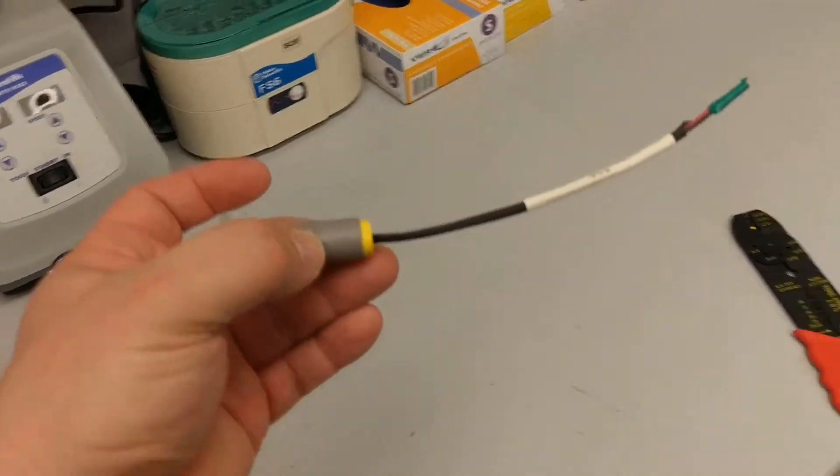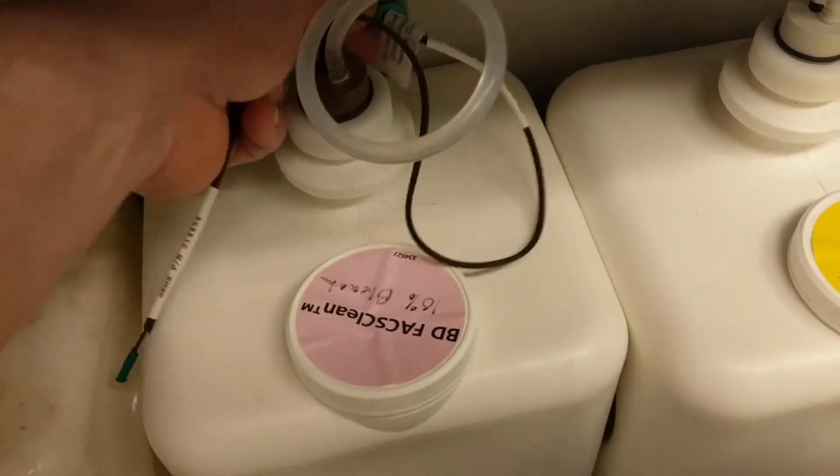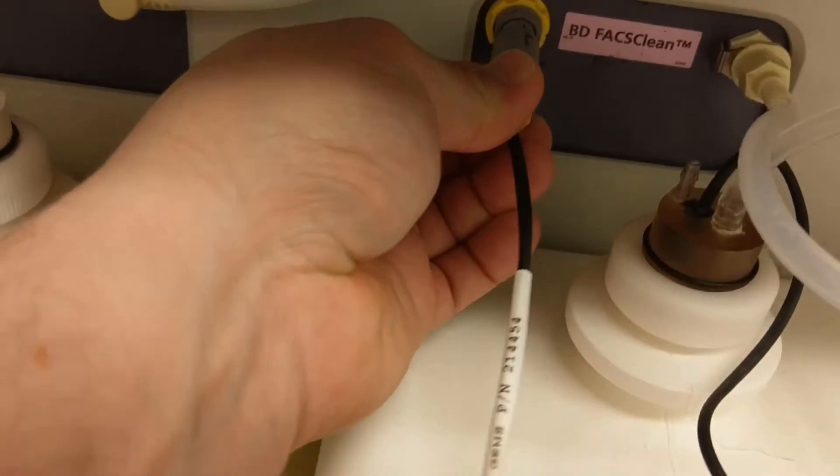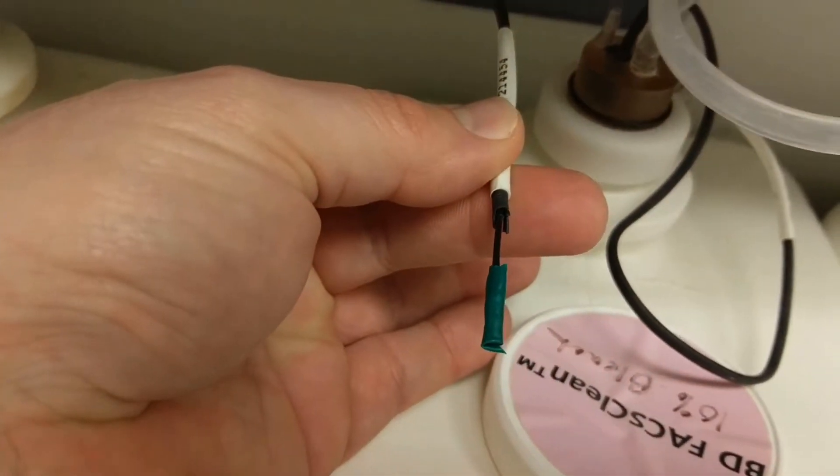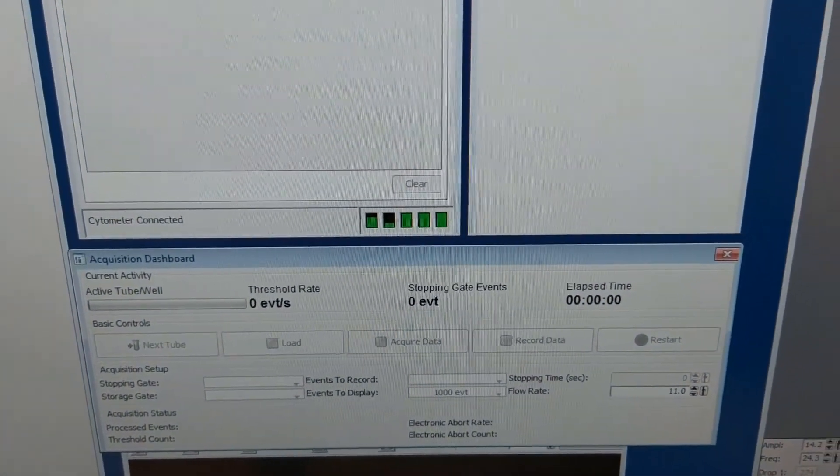So once that's fully taped, now you can just come over to your system, unplug the one that's not registering anymore, and just plug in your new one that you've just fused the wires together. And now if you come over to your software, you're going to see that now it's reading that all the tanks are full.